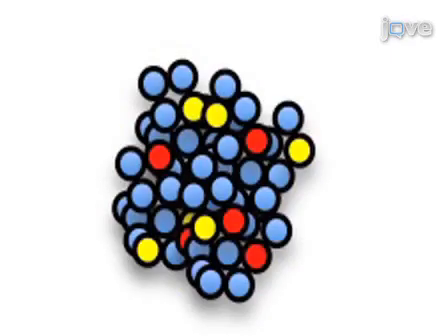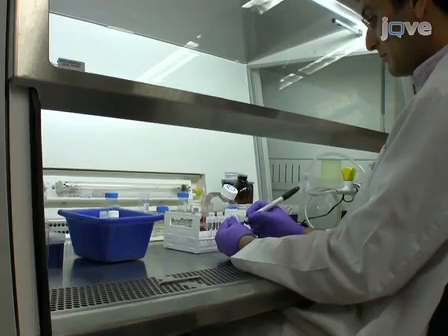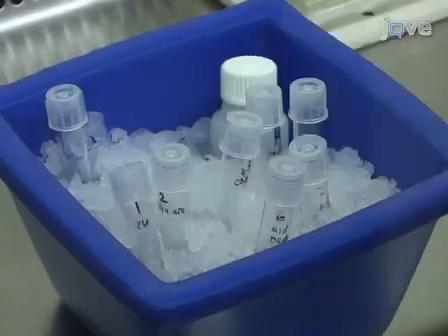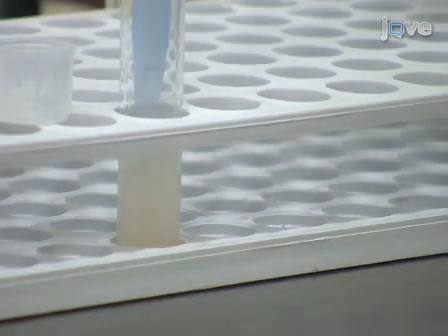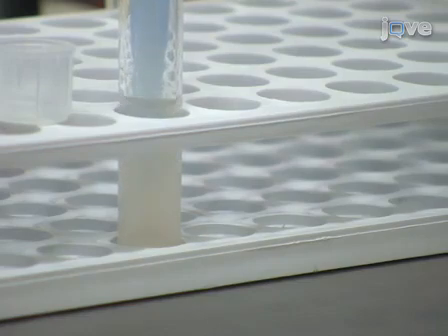Cells will be stained for aldehyde dehydrogenase activity using the Aldefluor reagent. Cells will also be stained for several cell surface antigens using specific fluorophore-conjugated antibodies. Label 7 12 by 75 mm polystyrene test tubes and place them on ice. Dilute the cell suspension in 2 ml of Aldefluor buffer to a final concentration of 5 to 10 million cells per milliliter and keep it on ice.